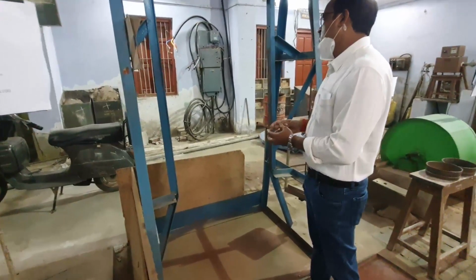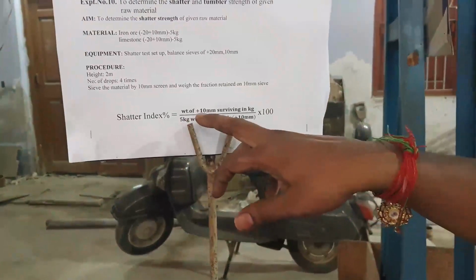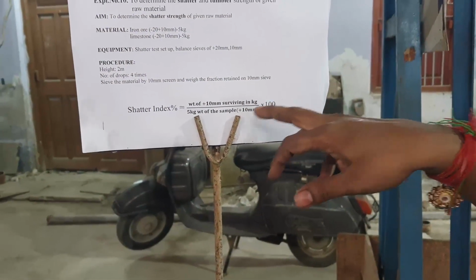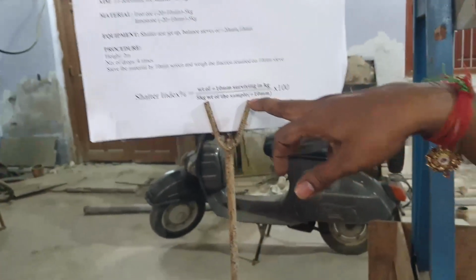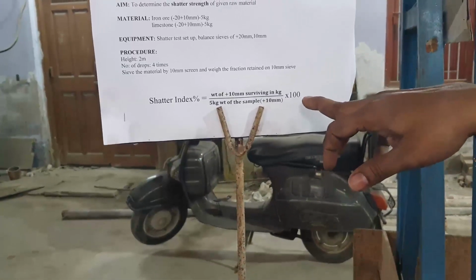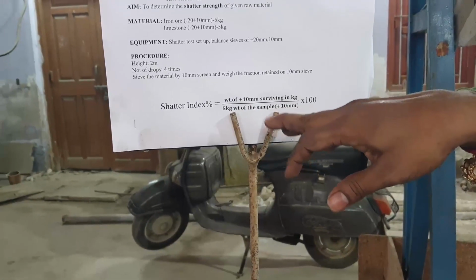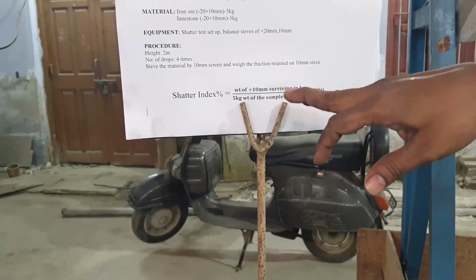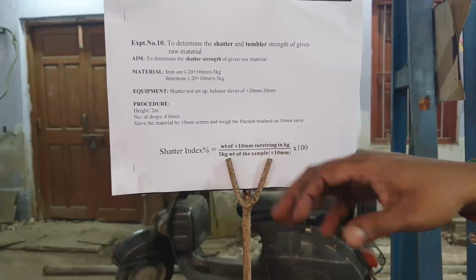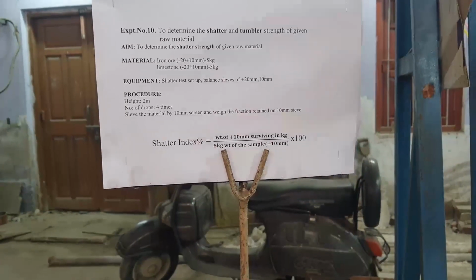That weight fraction we have to take, because to find the shatter index, the formula is: shatter index equals the weight of the plus 10 mm surviving material in kg, divided by 5 kg of the material, the initial sample weight, into 100. Here the initial raw material weight is 5 kg. We make this 5 kg material fall, subjecting it to impact force in the setup. As I told already, 4 drops you have to do, so we make it fall 4 times.